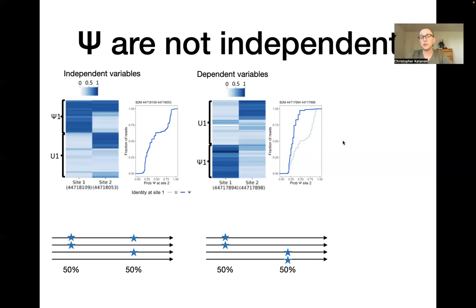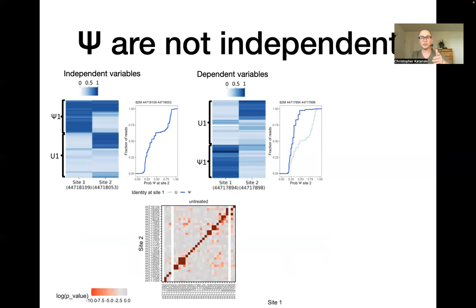And so I can do this calculation for every pair of sites in a transcript and ask how they are connected to each other. And your intuition is that they're not really going to be connected. They're independent sites. Many of them are very distal. And that's actually the result that we get. We see a lot of gray squares indicating that the p-values are not significant. Everything along the diagonal is perfectly correlated with itself. And we get a few large boxes, which are proximal sites that are correlated with each other. And that's the example I just showed you here.